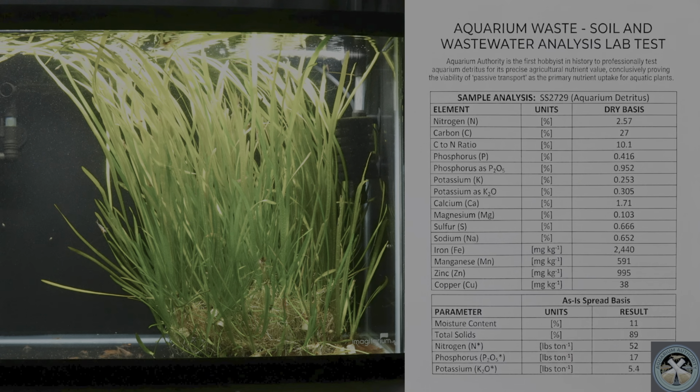And the next one is as is spread basis. So it's kind of what you would think in comparison to dry, right? As is means as is. It's a percentage in some cases, which is the moisture content, the total solids. And then for the rest, we've got pounds per ton. And we're going to talk about that.